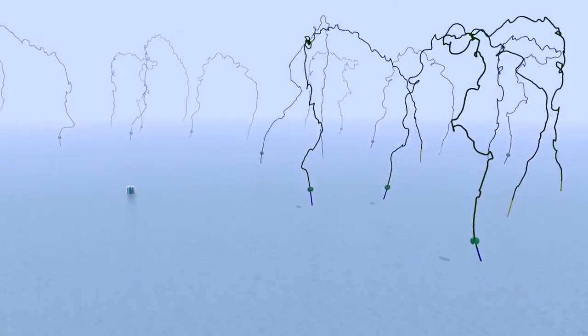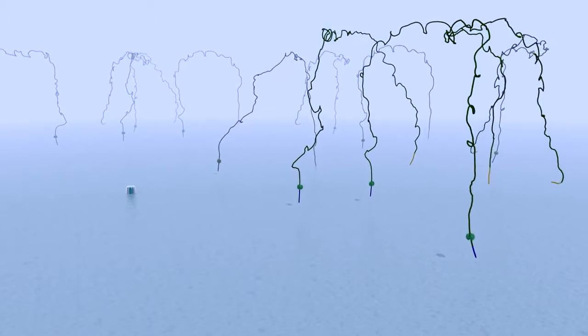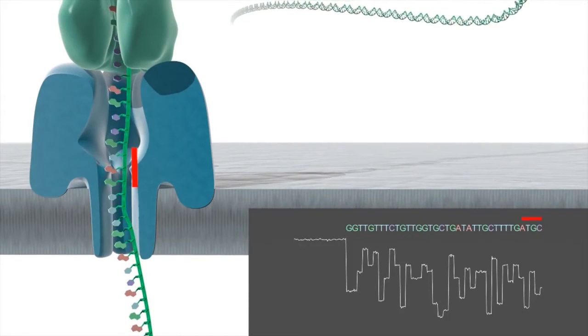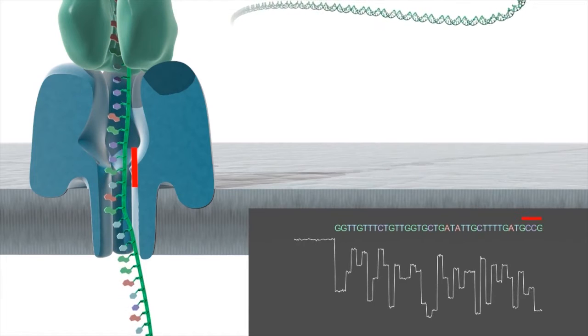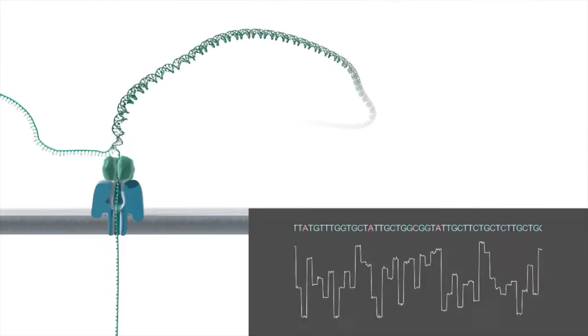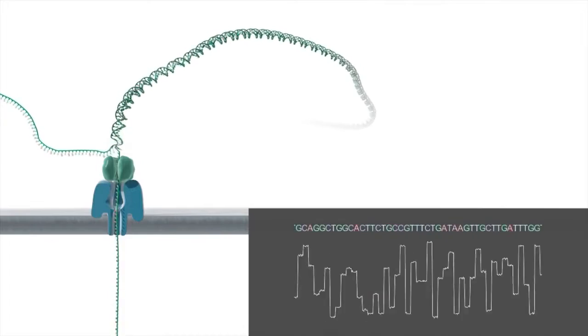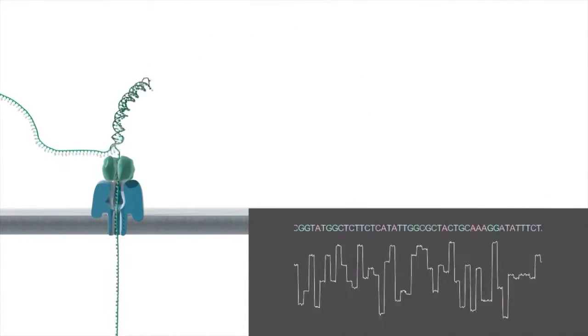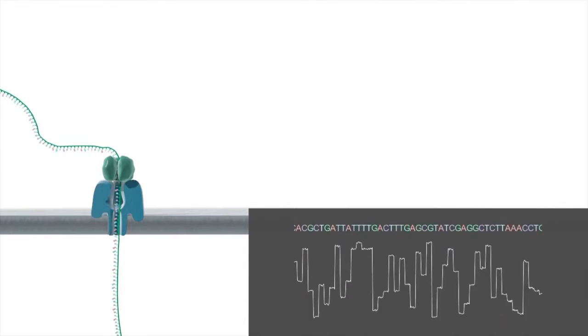The DNA strands to be sequenced are mixed with copies of a processive enzyme. As the DNA enzyme complexes approach the nanopore, the single-stranded DNA is pulled through the aperture of the nanopore. The enzyme, shown here in green, is designed to ratchet the DNA strand through the nanopore one base at a time. The enzyme binds to a single-stranded leader at the end of the double-stranded DNA template and unzips the double strand, feeding it through the nanopore.